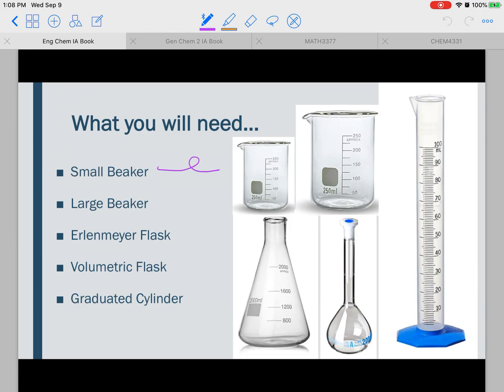So for this experiment, what you're going to need is a small beaker which is right here, a large beaker which is right here, an Erlenmeyer flask or what is also called an e-flask which is right here. We're also going to be using a volumetric flask which is right here, and we're also going to be using a graduated cylinder.